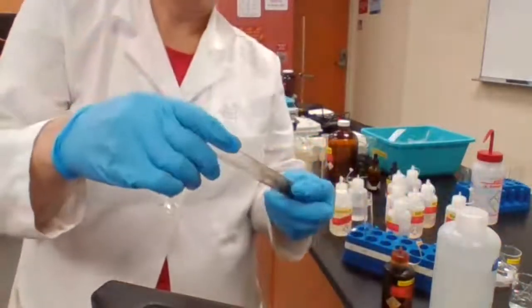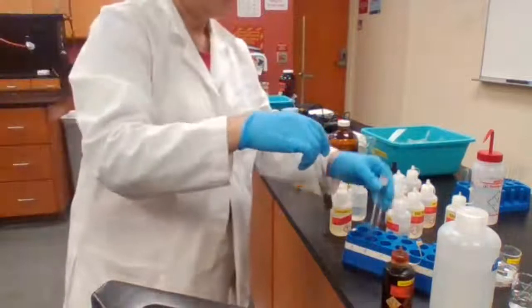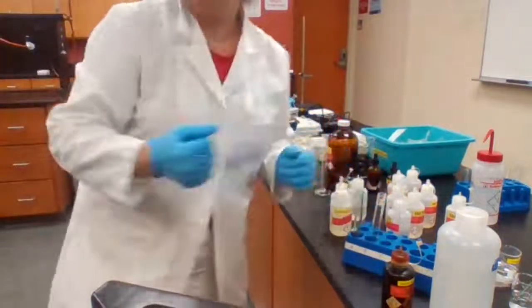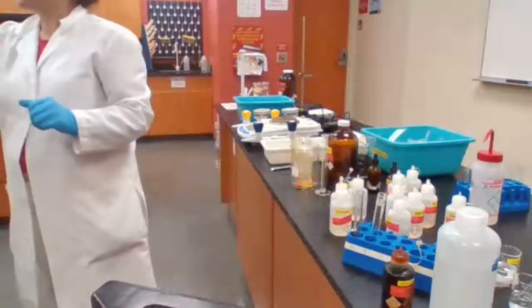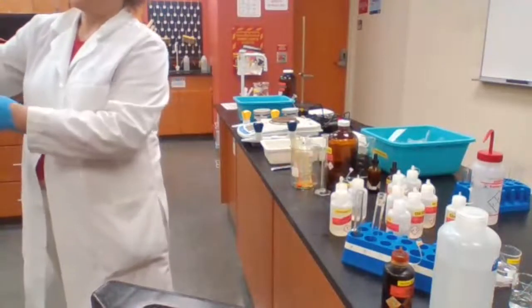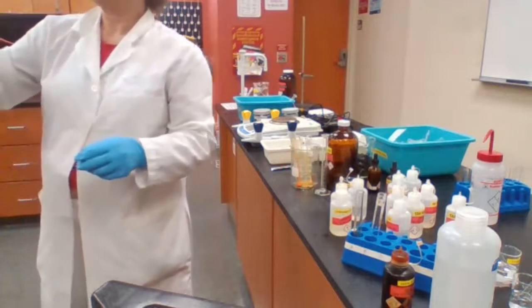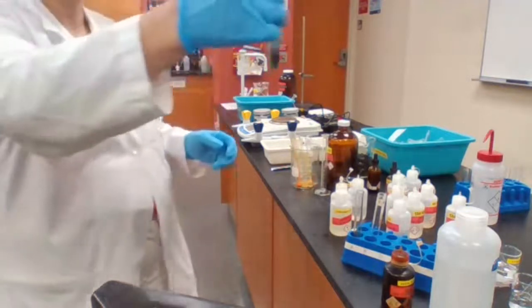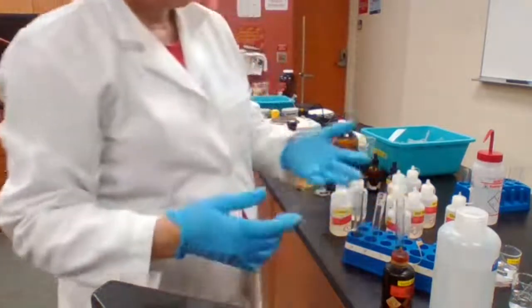Okay, good. At least it does help. Perfect. Yeah, this one did not react and stayed gray. Okay.